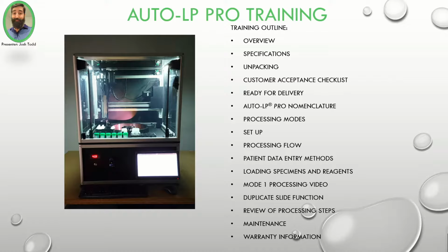We'll then dive into the essential maintenance guidelines to ensure longevity and optimal performance of the instrument. And then we'll cover the warranty information, understanding the warranty coverage and support provided with the AutoLP Pro. By the end of this training, you will be well equipped to handle the AutoLP Pro with confidence and proficiency, delivering reliable and accurate results in cytology processing. So let's embark on this learning journey together and unleash the full potential of the AutoLP Pro for improved diagnostics and patient care. Let's get started.